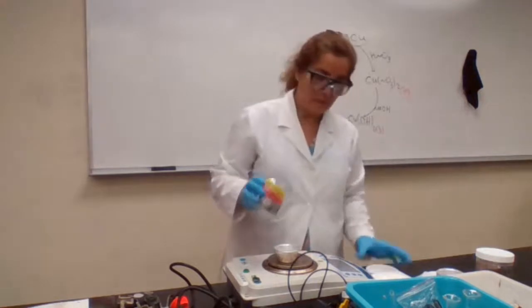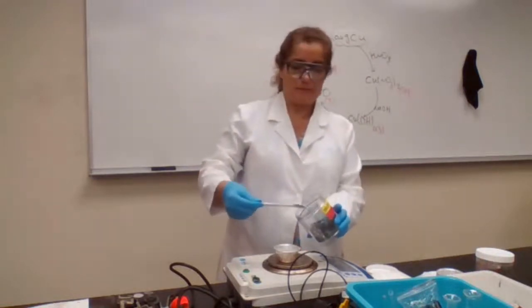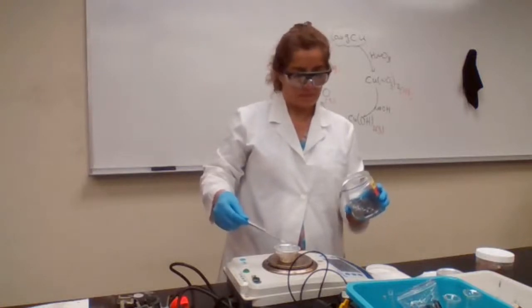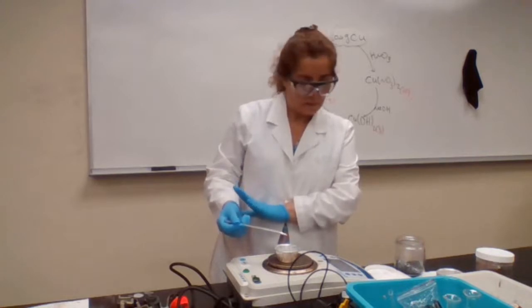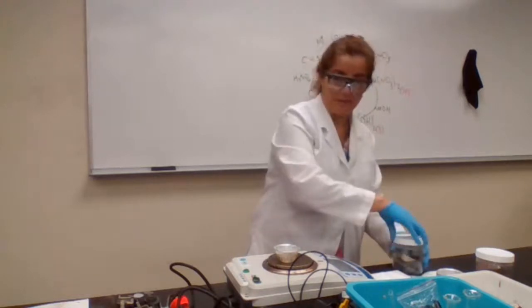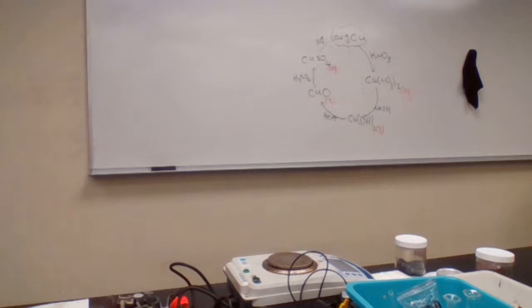So we are going to measure about 1 gram, or approximately 1 gram of magnesium. Okay, that's 1 gram of magnesium measured. Okay.